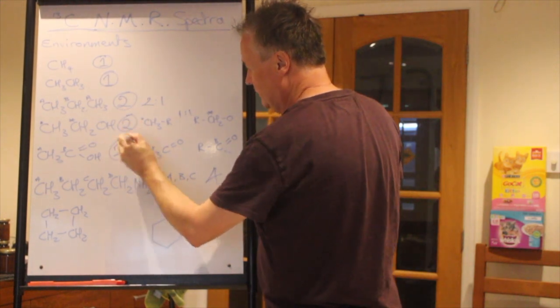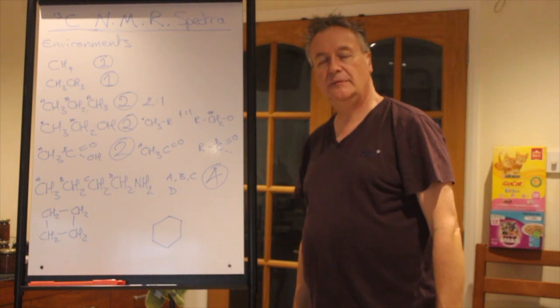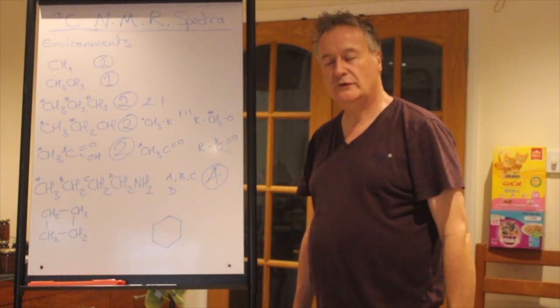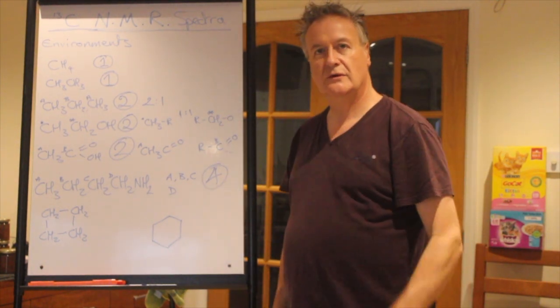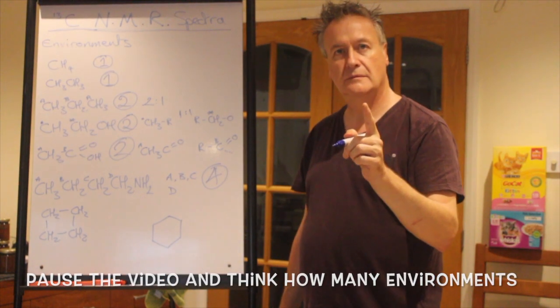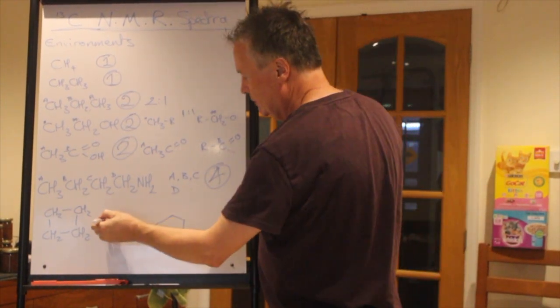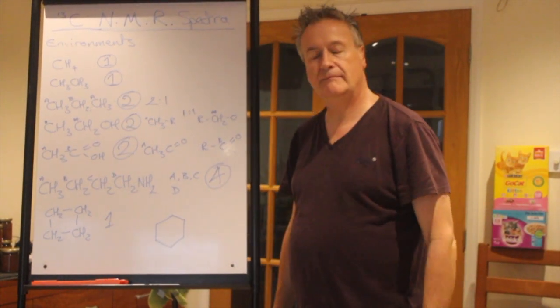At the bottom of the board, cyclobutane, C4H8. How many environments? Have a little think. And have you thought how many environments? They're all the same.